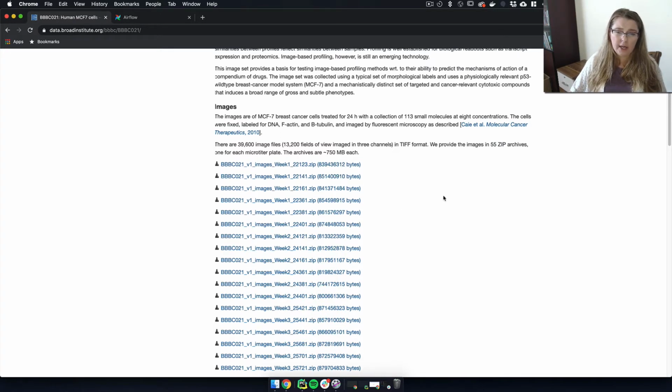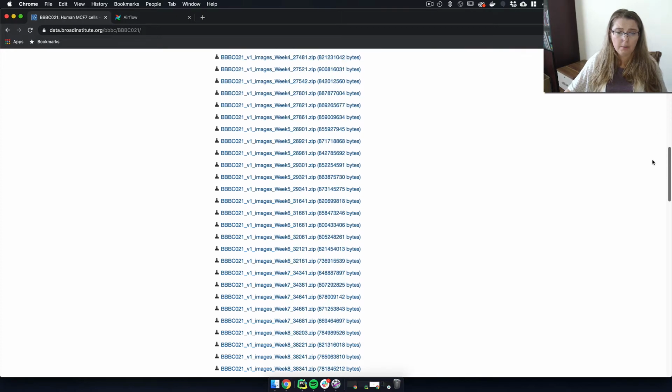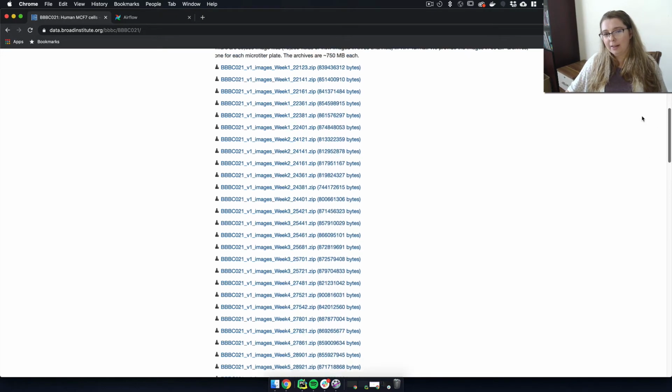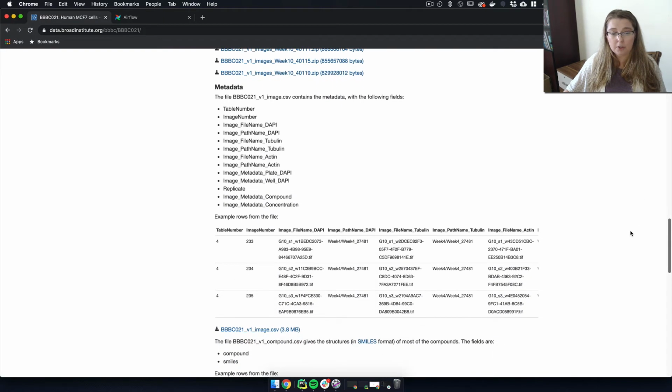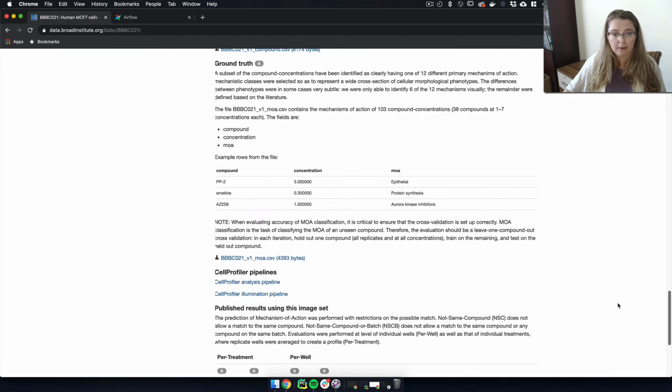I don't use all the data here. I have a demo instance. If you are interested, you can contact me about that, where I have all the data downloaded. It's all in Apache Airflow. You can see how the whole entire pipeline runs. And it's on AWS. But look at this, I'm not going to have all this on my laptop. I keep filling up the storage on my laptop. It's getting to be a problem for me.